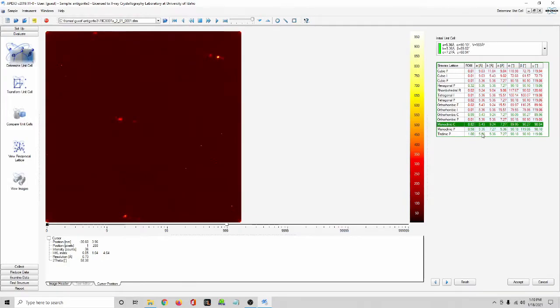So I'm just going to skip that step and go straight to the monoclinic C, especially since it gives a good figure of merit. There's a lot of reasons why you could come up with this monoclinic C, most of it being guess and check, but some of it is actually just looking at the reciprocal lattice. So let's just go with this one.